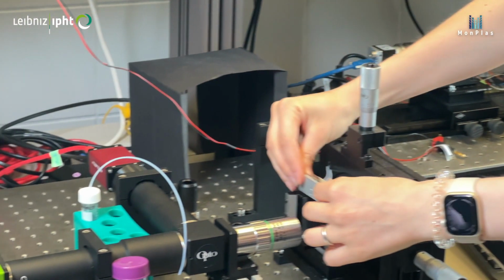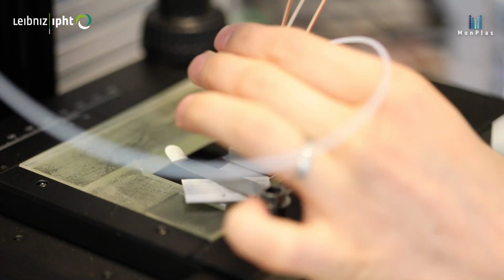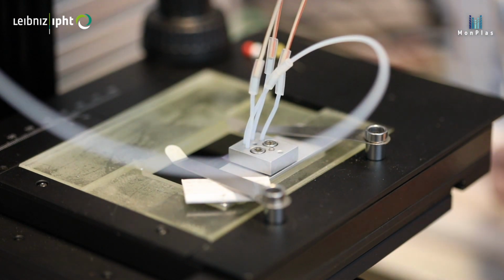In my next part of the project, I will apply all these methods that I've told you about already for different microplastic materials and use our imaging flow cytometer to evaluate and analyze them. So overall, we image particles in flow. We track them, analyze their size, color or movement. And whether those particles are microplastics, cells or nanoparticles, in high throughput, all of these are able to be analyzed with our setup.